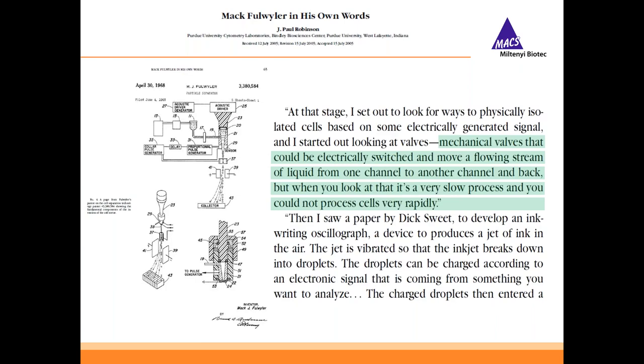And he said, "At that stage, I set out to look for ways to physically isolate cells based on some electrically generated signal. And I started out looking at valves, mechanical valves that could be electrically switched and move a flowing stream of liquid from one channel to another channel and back. But when you look at that, it's a very slow process and you could not process cells very rapidly."